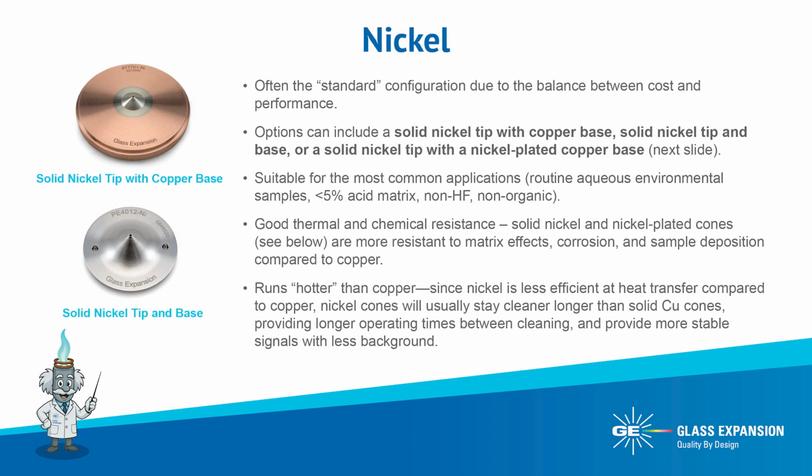Next up, we have nickel, which is commonly the standard choice because of its balance between cost and performance. With nickel, there are several combinations of materials to choose from. This can include a solid nickel tip with a copper base, a solid nickel tip and base, or a solid nickel tip with a nickel-plated copper base, which I will explain in more detail shortly.